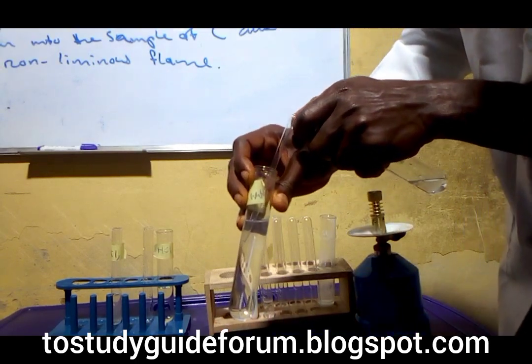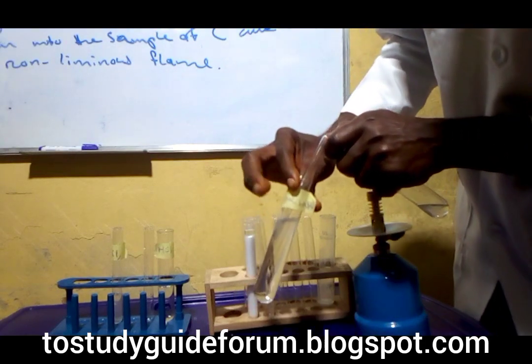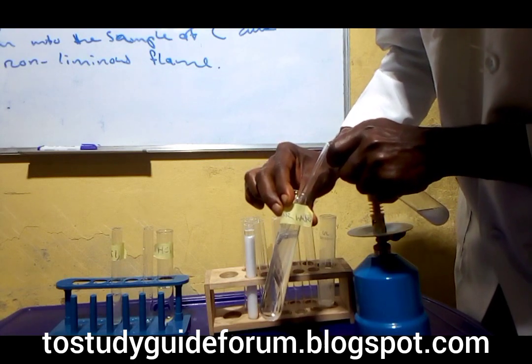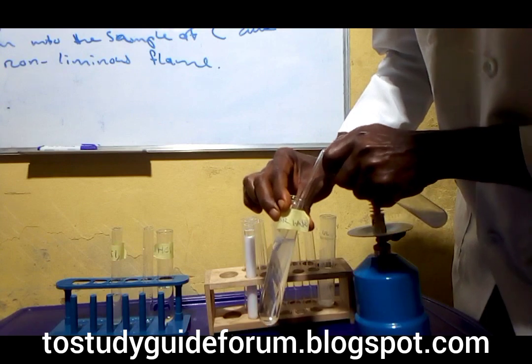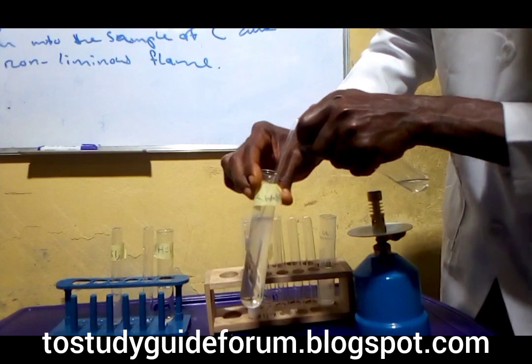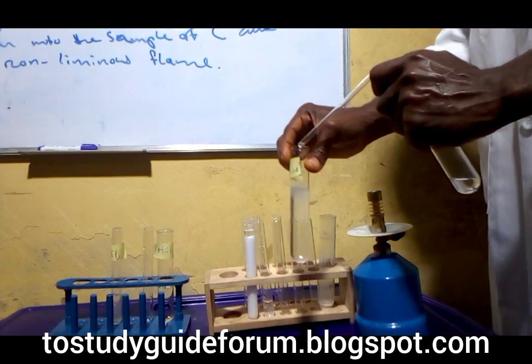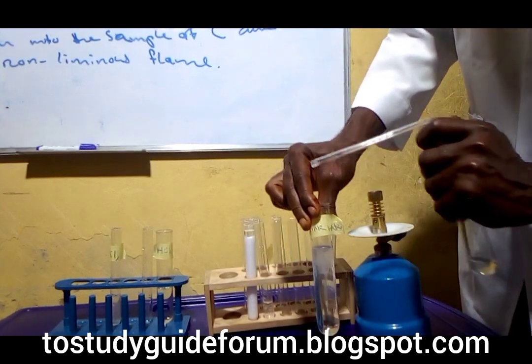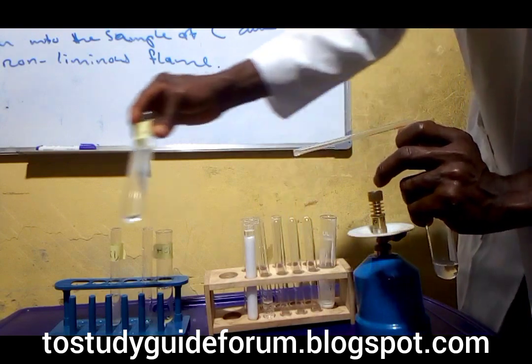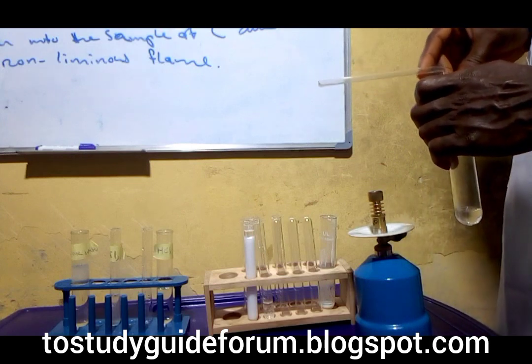The milky color is turning lime water milky, confirming the presence of what? It's confirming the presence of carbon(IV) oxide. That means carbon(IV) oxide gas is coming out. You can see it is turning milky. If you look very well, you find that it's turning milky now. Look at the bottom and the top one. You notice that it's turning milky already. That means the gas we have here is carbon(IV) oxide, confirmed.